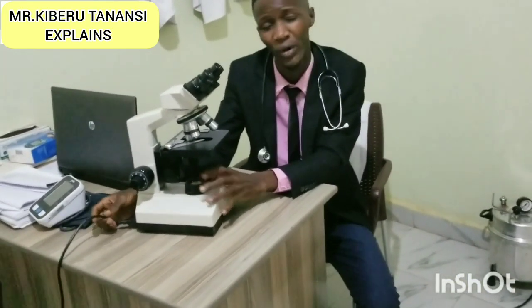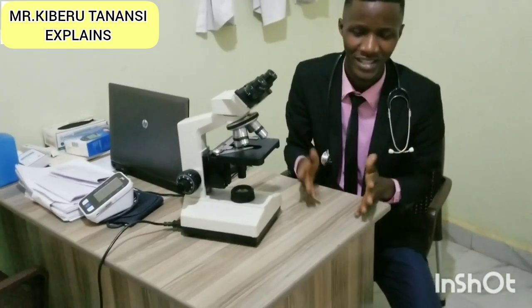Please, you can repeat this video when you don't understand. Repeat and repeat up to when you understand these different parts of the microscope. So I'm going to take you through this modern light microscope. Why am I calling it a modern light microscope? Because its light comes from a bulb, so we connect it to electricity. But before science evolved, the light microscopes were using light from the sun, so natural light. But this one, we can connect it to electricity, and it provides us with light. So let us go through the different parts of this light microscope at our facility.